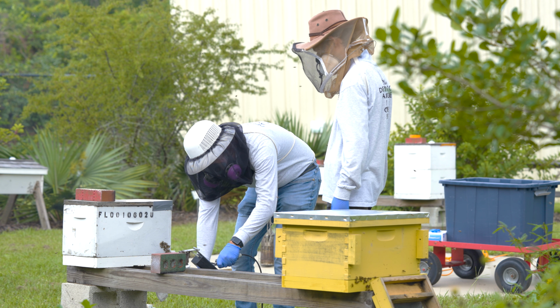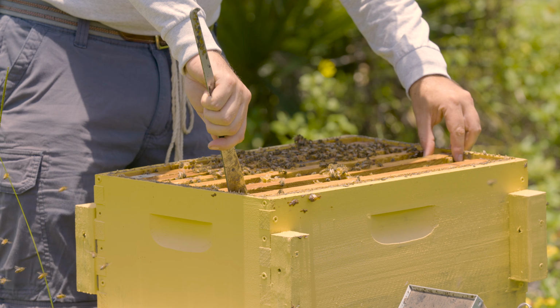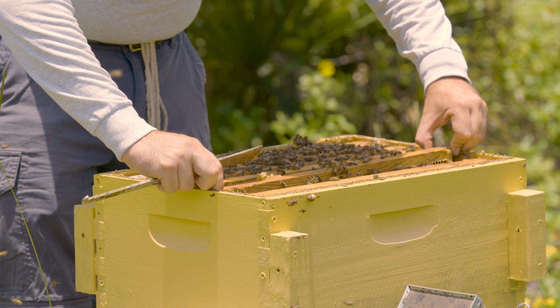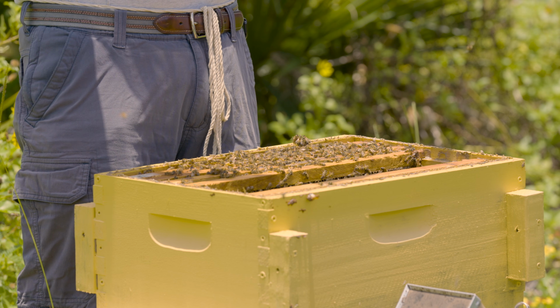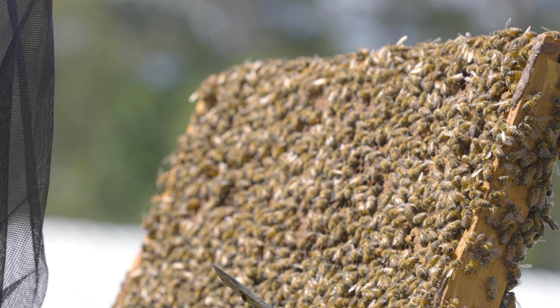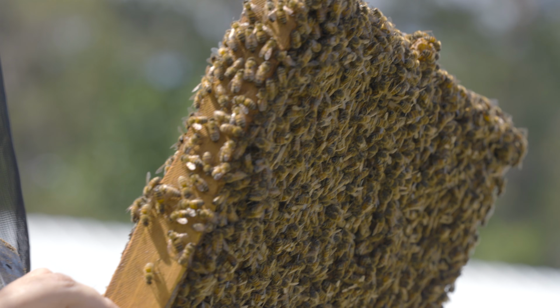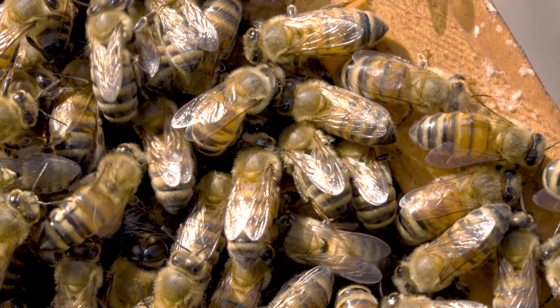The first thing that you're going to need to do is collect bees from hives that are more likely to have tracheal mites than other bees from those same hives. It's real easy to think about. Essentially, older bees are more likely to have tracheal mites than younger bees. So when you go to a hive, you're really going to want to target those older bees, and there's a handful of ways that you can do that.